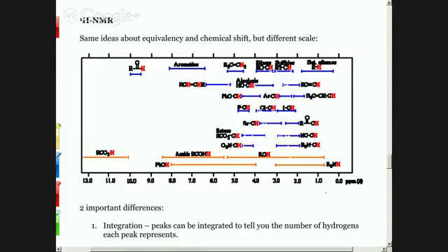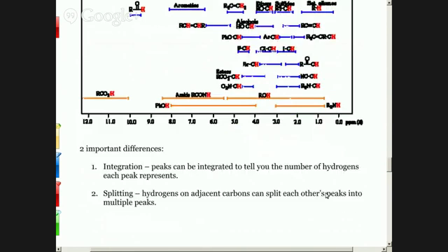All right, so that's this idea of shielding, that we can make some conclusions about what's happening in the spectrum based on, I'll just leave that there. What page is that? This is 387. Now, that's not something you need to memorize, and honestly, it's not even something that's going to be all that useful when I give it to you, which I will, because there are other parts of hydrogen NMR that can tell us even more information than that, and that's what we're going to focus on now.